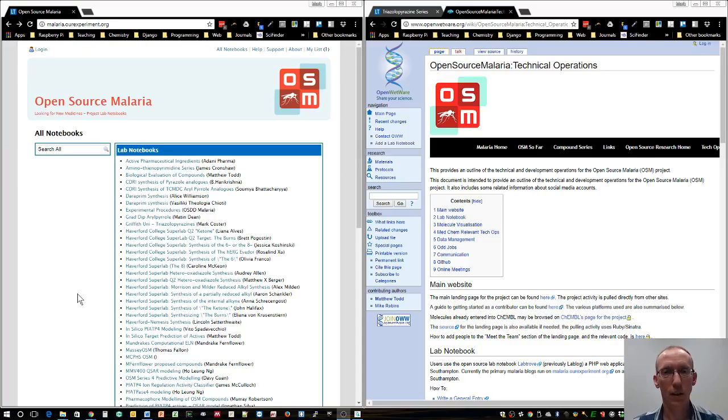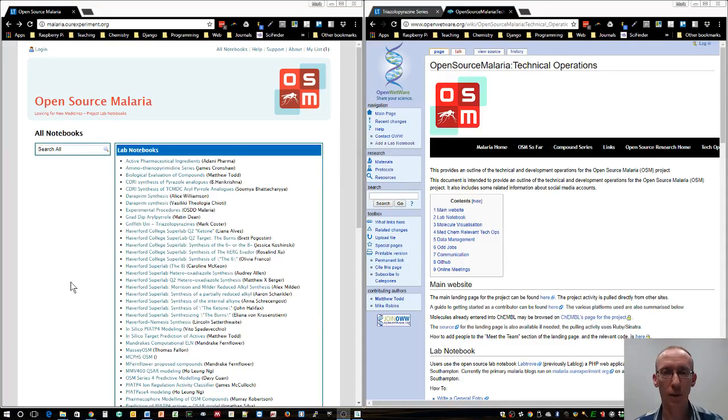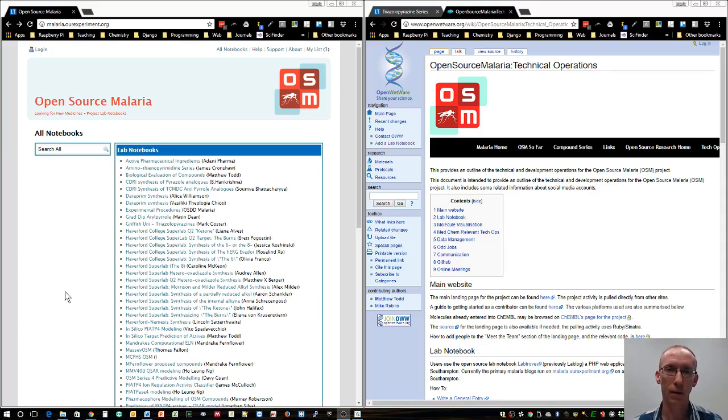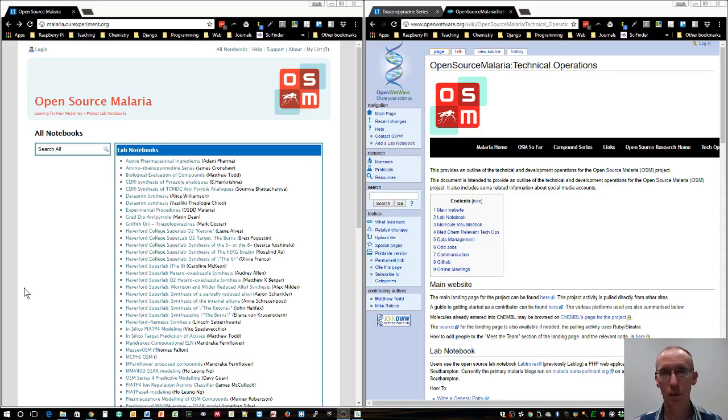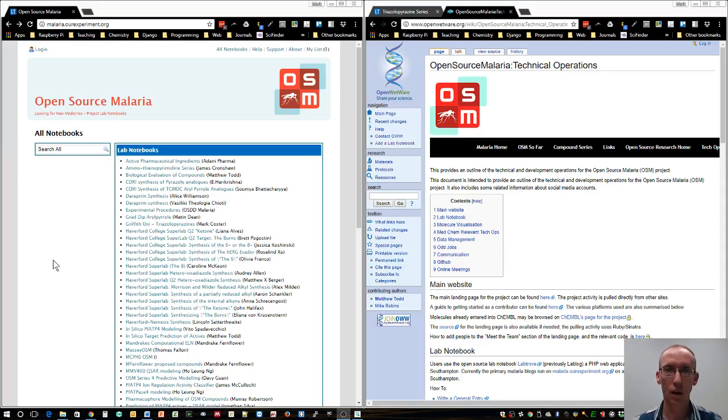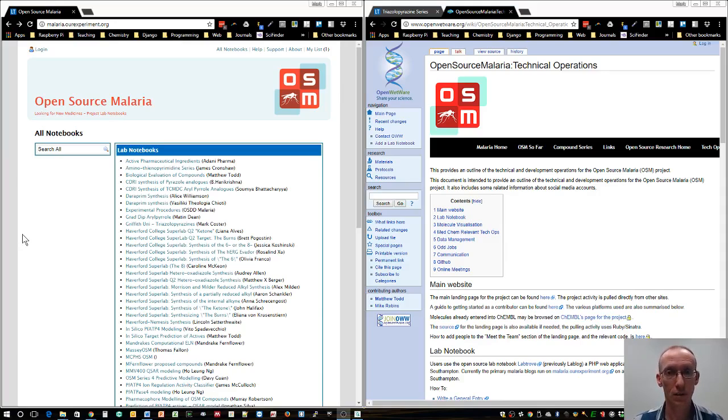Hi guys, today we're going to set up an electronic lab notebook. This is a really important part of contributing to the open source malaria initiative so that we can share our results with all the other researchers around the world working on this really important project.